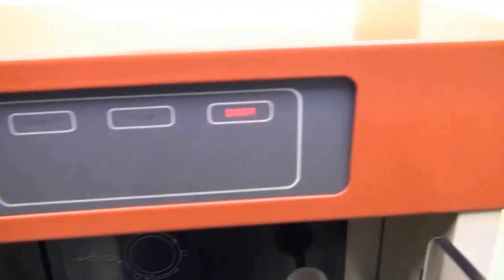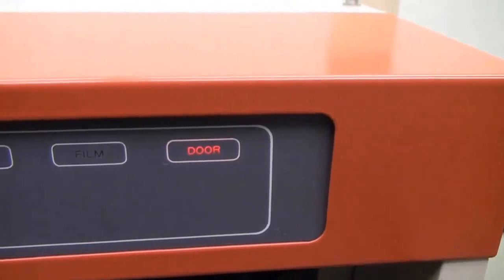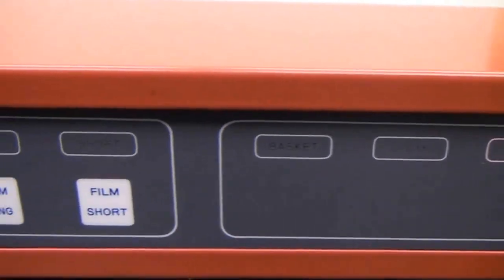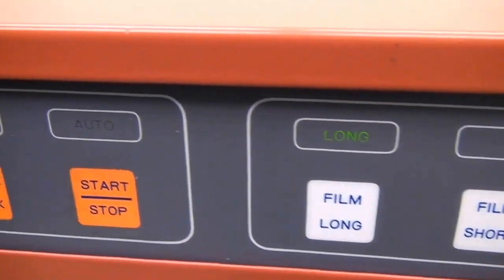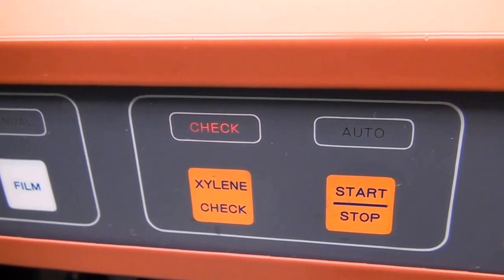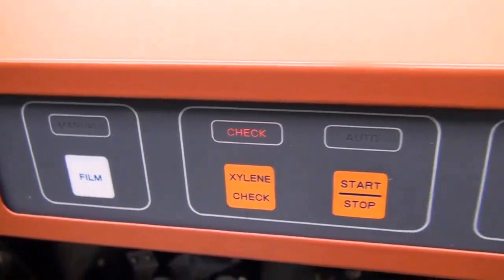You can see all of our lights up here. We do have a door air light. We have it set on the long film. Normally the Xylene check button always comes on, so we'll have to push that.